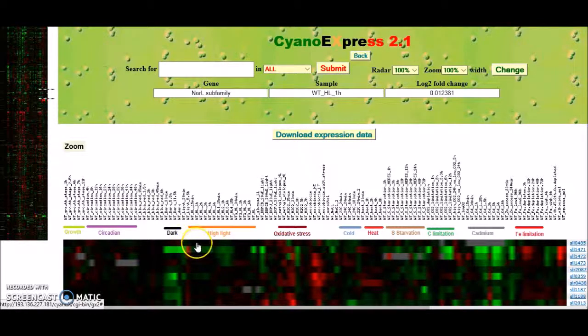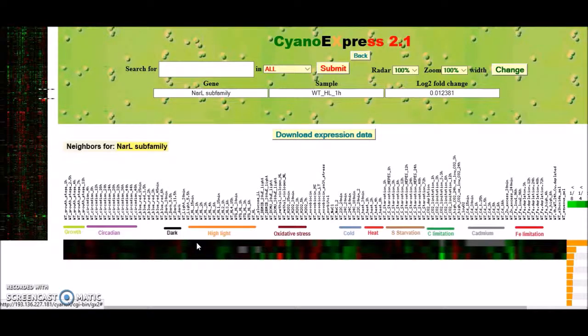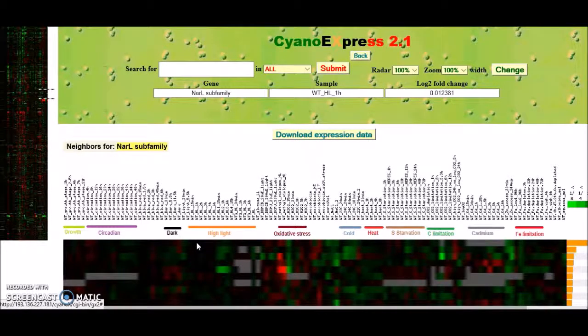Selecting any given row on this heat map will update the magnified image, providing a new map with the given gene now located on the top row, followed by 20 genes with the highest expression correlation to this gene. This process can be used to identify potential functional roles of proteins encoded by hypothetical or unknown genes. The yellow bar on the right-hand side indicates the degree of correlation between this gene and the gene selected in the top row.